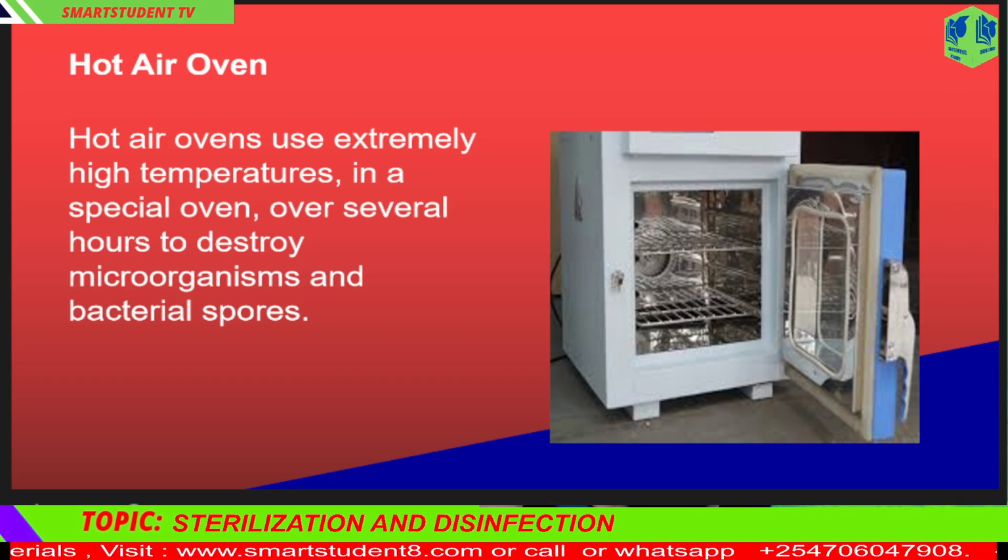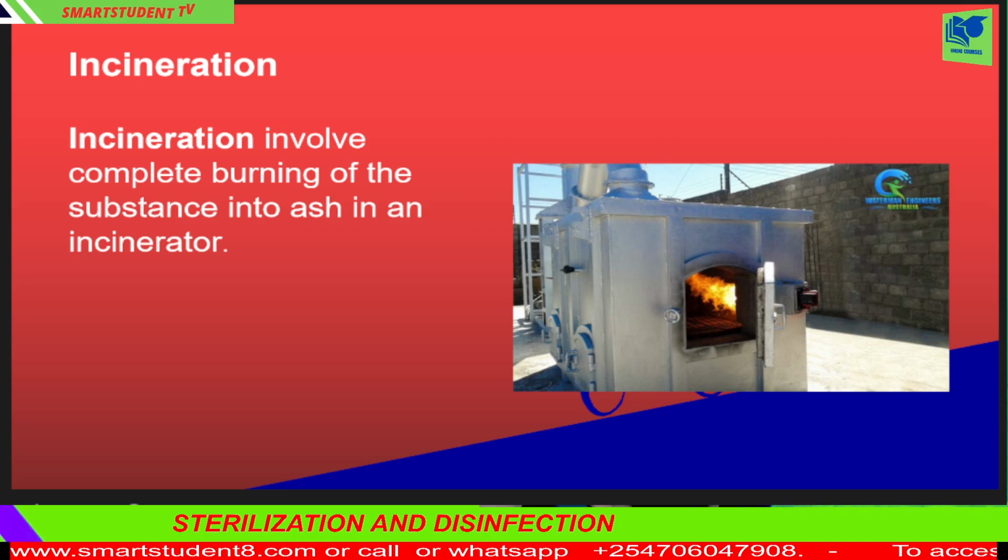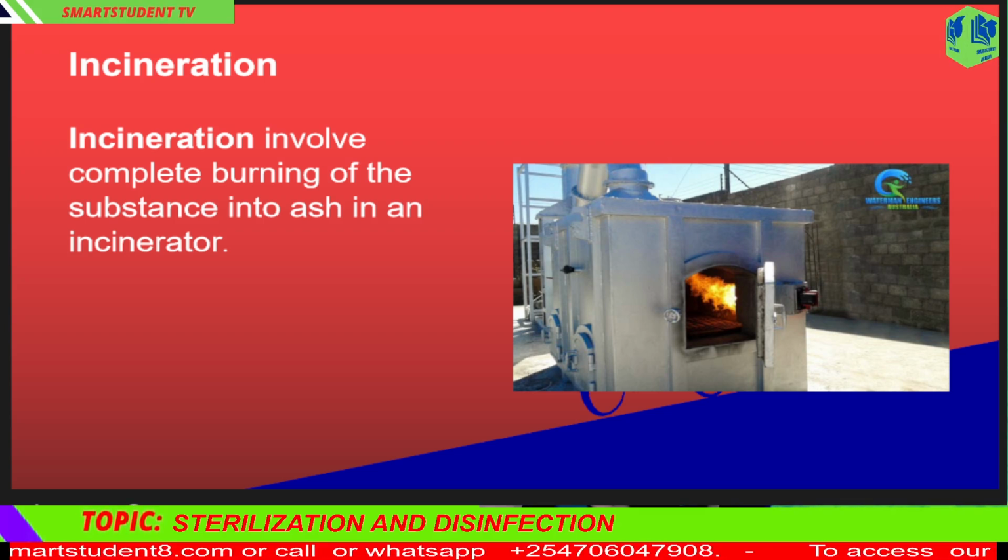4. Incineration method. In this method, waste materials are burned at extremely high temperatures. Incineration method is often preferred as a safe disposal of medical waste. The method completely eliminates pathogens. Nonetheless, this method raises environmental concerns due to emissions.